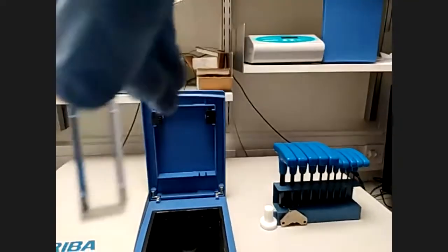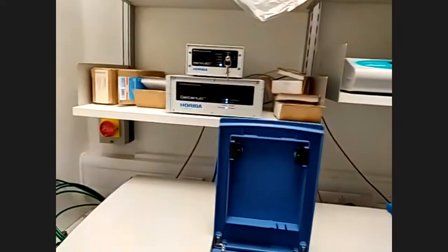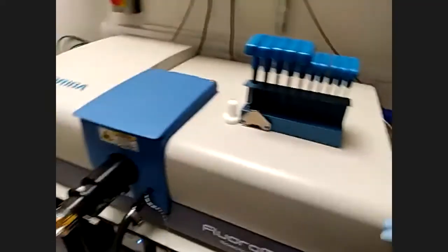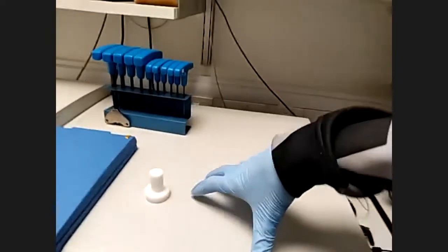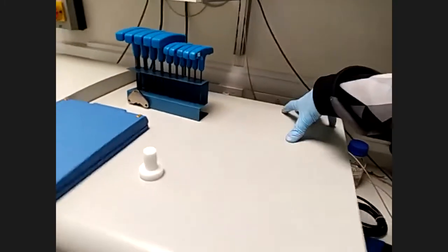Oh, where's my camera? It's on the other side. So this is the bovine serum albumin in solution here, right? And then I'm going to put that in the spectrometer, and then there's a detector and another prism, which we can move to select wavelengths of light that we're measuring, and then a detector that will measure that.